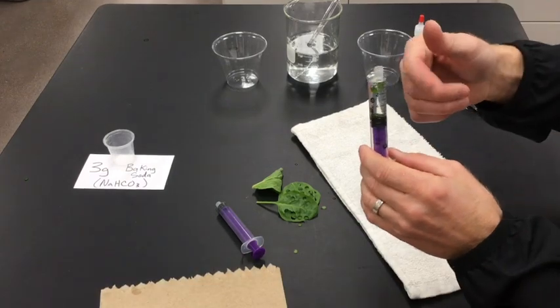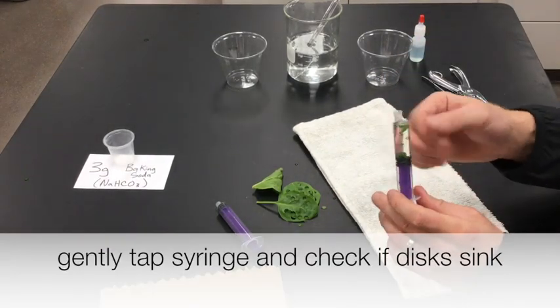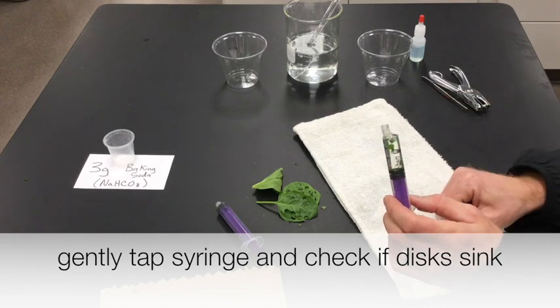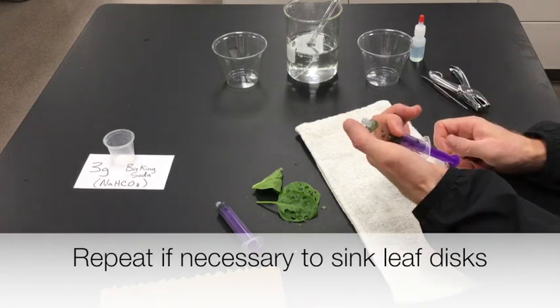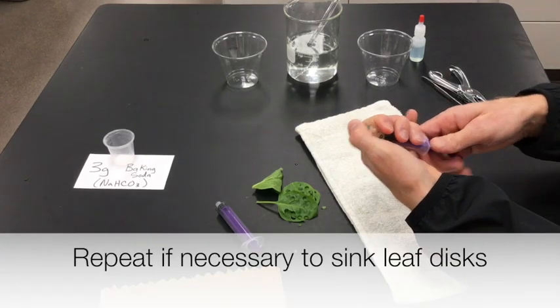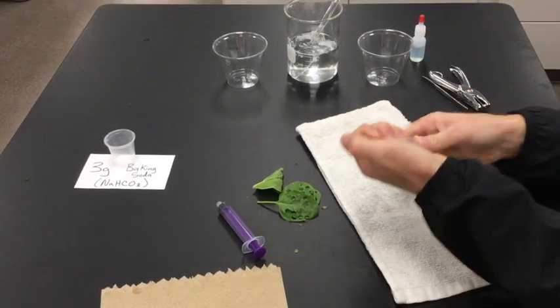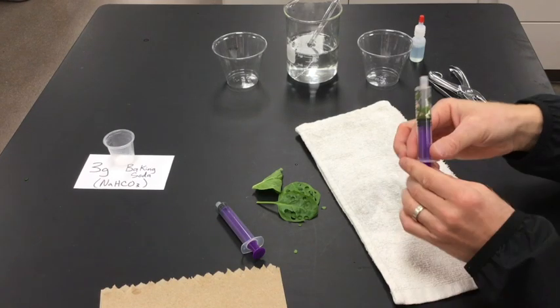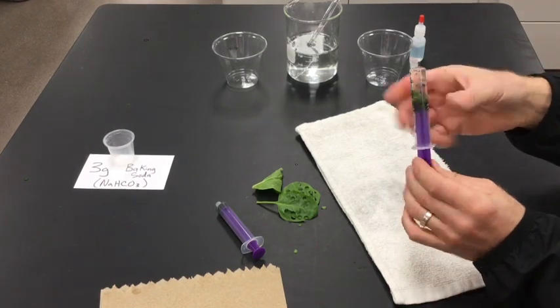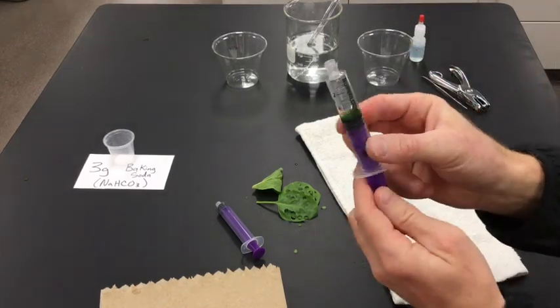You can see some of the leaf discs are floating and some are sunk, so I'm going to repeat that process. Cap it with the thumb, pull back on the plunger, shake, and push up on the plunger. And they are all sunk.